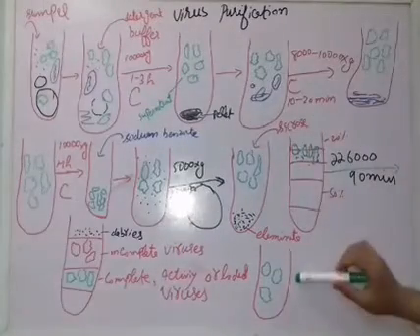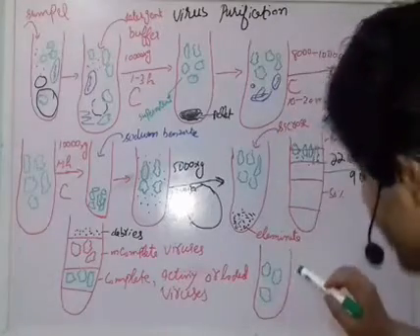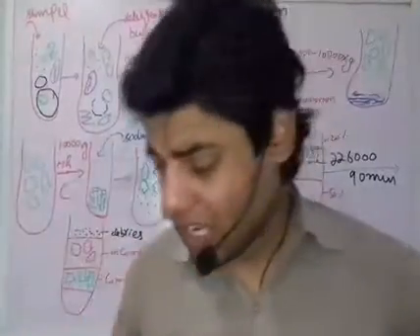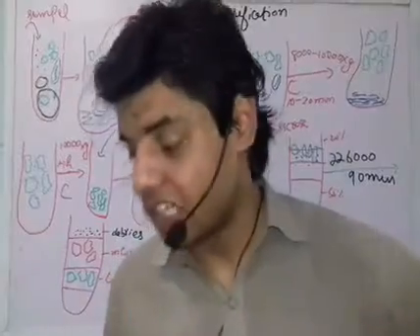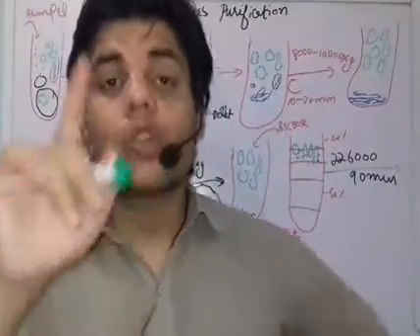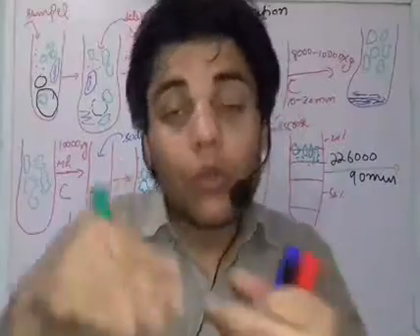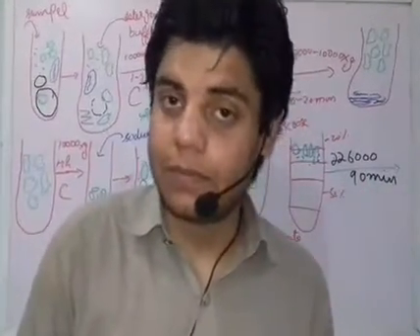Now once we get these viruses, actually we need these viruses, and then we put these viruses through different tests. Means then we check it under the microscope, electron microscope, under the X-ray diffraction, what kind of virus actually it is. Fine. So that's why we do the whole process, to isolate the active viruses and to check which kind of active viruses they actually are.